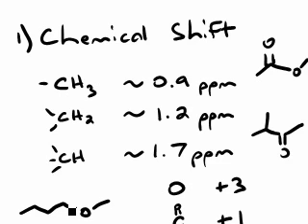So in other words, inductive effects taper off drastically with distance, where the plus 3 is really only for the carbon atom that is directly next to the oxygen. As soon as we move one away, it drops from plus 3 to 0.5. Also, for example, here, this CH group, we're going to add plus 1 for being next to a carbonyl. But this CH3 is one removed from the carbonyl. So instead of adding plus 1, we might only add plus, let's say, 0.2, something like that. And if you're even further removed from the carbonyl, then it probably won't be noticeable.